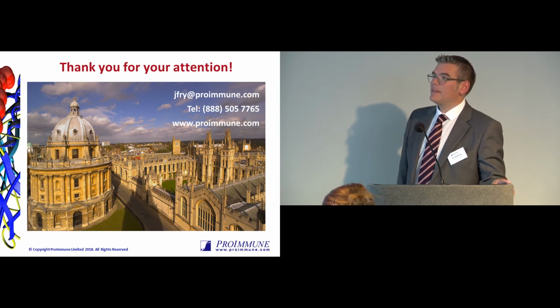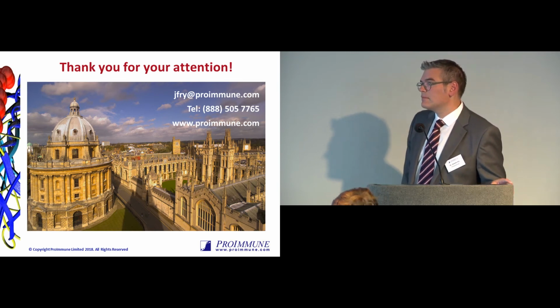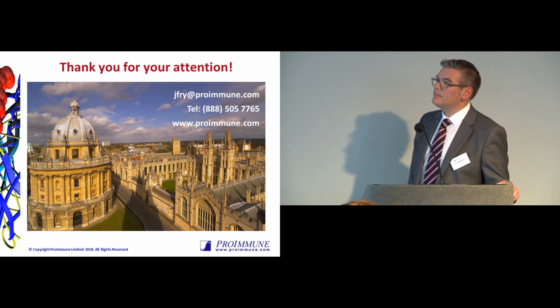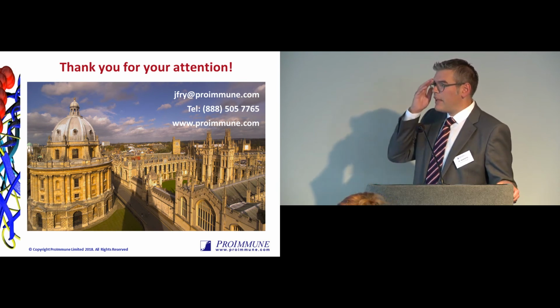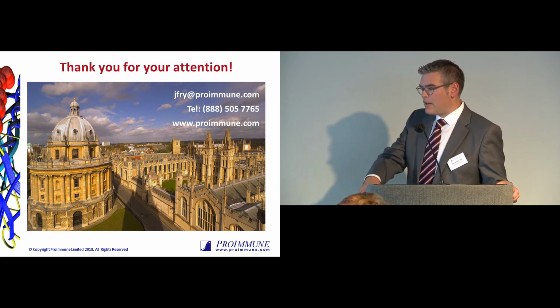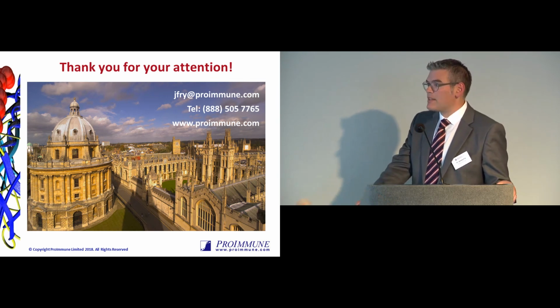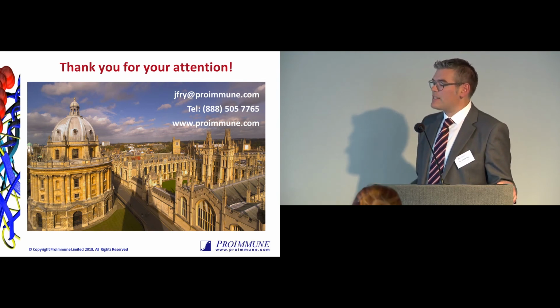Shivani, yeah, thank you. So when you report parameters like expect value or your response index, are these generally accepted when you file reports with regulatory agencies, or is this something unique? Okay, so there's a few points there. The expect value is definitely a standardized term in relation to proteomics. The response index is not. That's something which we at ProImmune have devised.